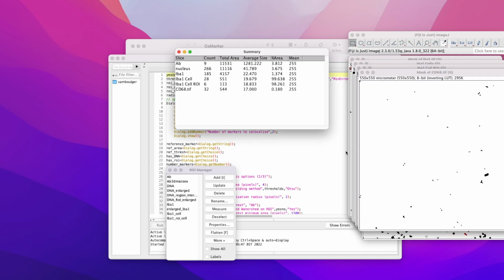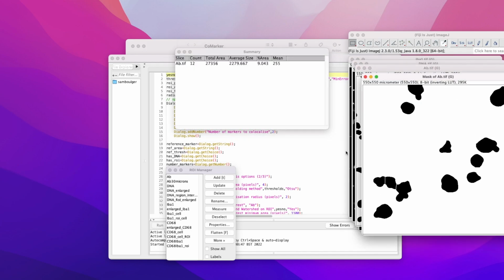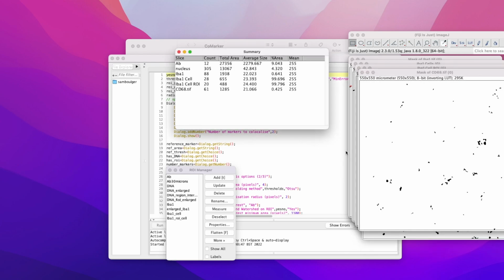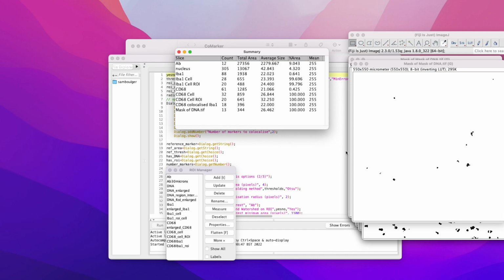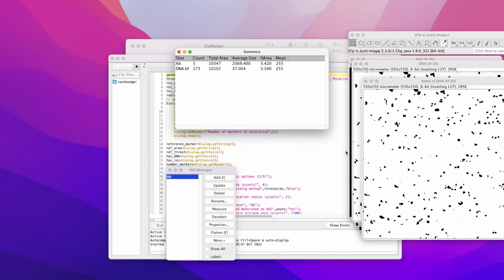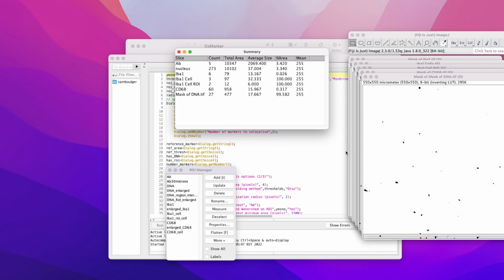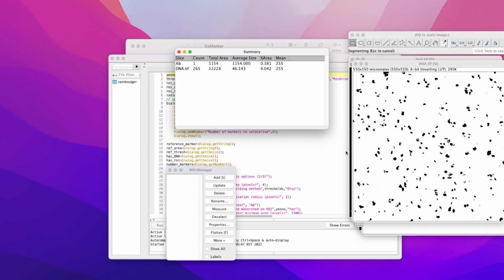We can see in the summary table what the code is analysing. In this run of the code, we've used amyloid beta as the region of interest. We're also counting how many nuclei there are. We're analysing the IBA1 signal, as well as when that signal is within 2 microns of a nucleus. We're also analysing the reference marker signal within 2 microns of the nucleus, within range of the region of interest.